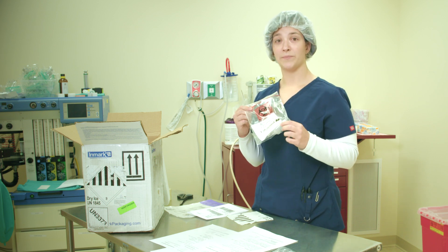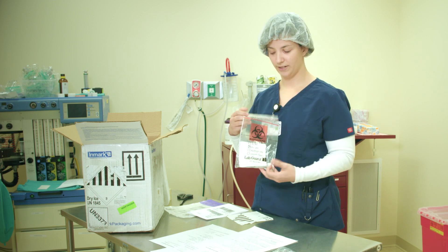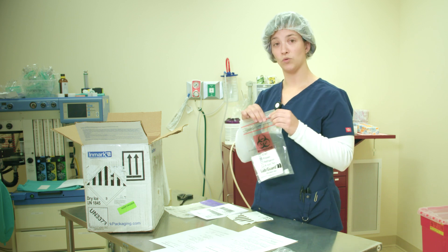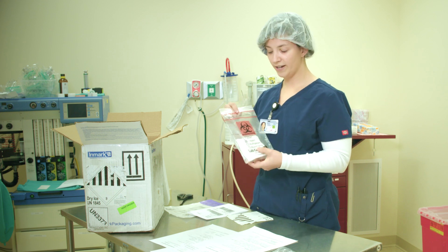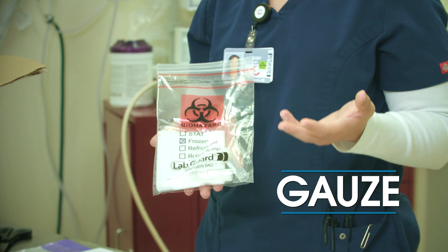The tube that the sample is in is called a primary receptacle. It has to be watertight. That will be placed in a secondary receptacle like a biohazard bag that is also watertight and sealed. Inside that bag needs to be an absorbent material. Right now I'm showing you gauze, but you could use paper towels or anything that will absorb anything that leaks.